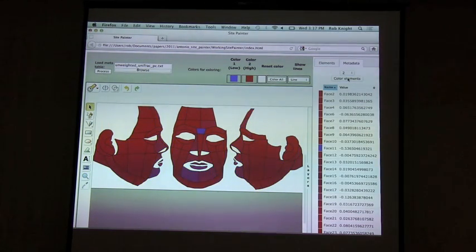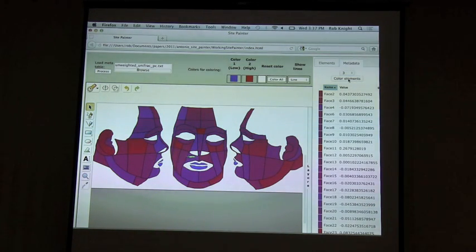If I show you PC2, it's a bit puzzling because there's one patch that's really different. Our current conjecture is that it's because our subject wears glasses and tends to adjust them from time to time, and your fingertip communities are pretty different from what's on your face. And then if we look at PC3, what you see is the separation between the lips and the rest.